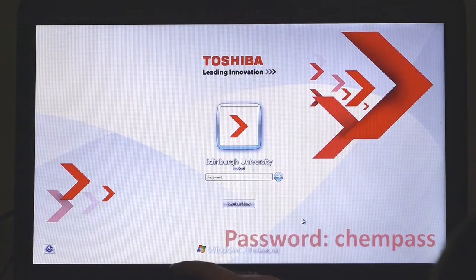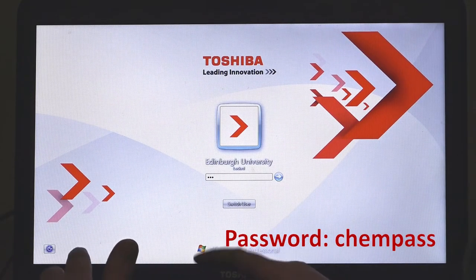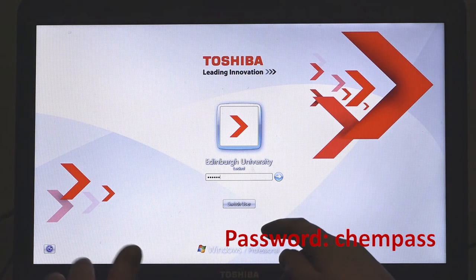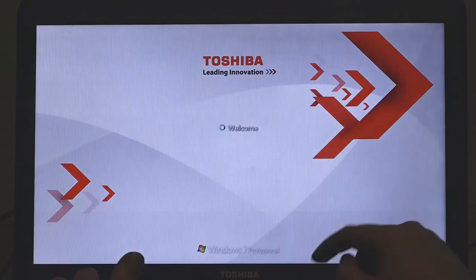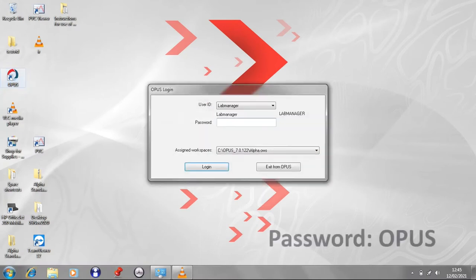Switch on the laptop. Wait until it boots up and then enter the password as given here. Now that the laptop is booted up, we'll use a screen capture program for the rest of this video. Click on the icon for the OPUS program and enter the password as shown here.